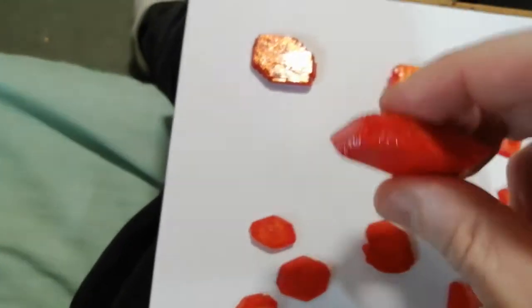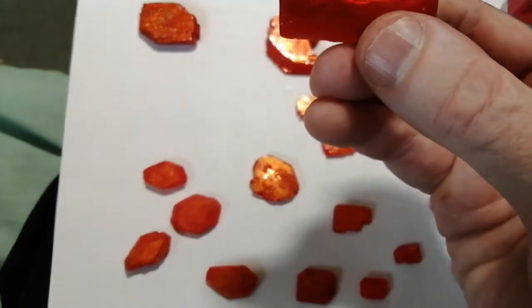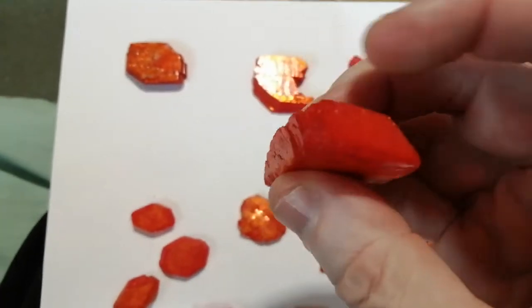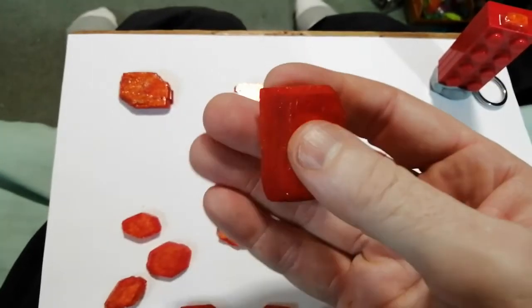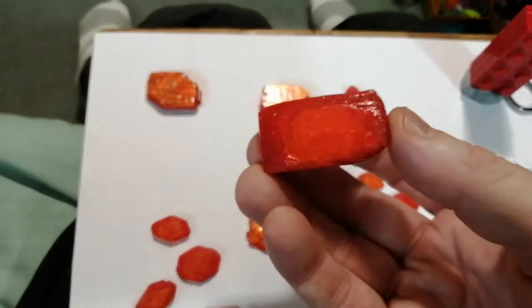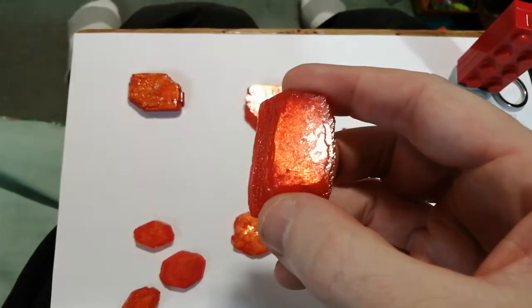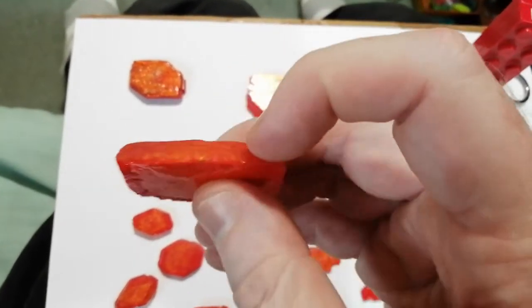This one, which is the biggest one I've got, that's how thick it is. In real life it's about 1 centimeter thick, and it's about 3-4 centimeters long, and that's its cross section. So it's not been cut, it's not been dropped or anything. This is how it's grown, and it's rather rounded in places, partly due to the fact that it's slightly dissolved if there was any temperature change in the airing cupboard. And also the other reason why it's round is as the crystal got fatter, it got closer to the top of the solution, and as I ran out of chemical, it would evaporate, and of course the top would stop growing, the bottom would carry on, and eventually you ended up with this kind of stepped look.